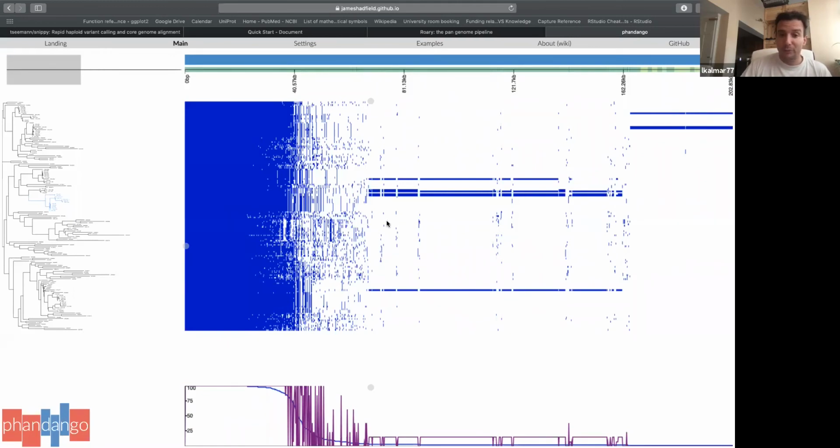This can be done by two different programs, but as far as I understand, they are doing the same. I'm using Mash for that, but there are many people who are using FastANI, and that's what I also sent you as the link.